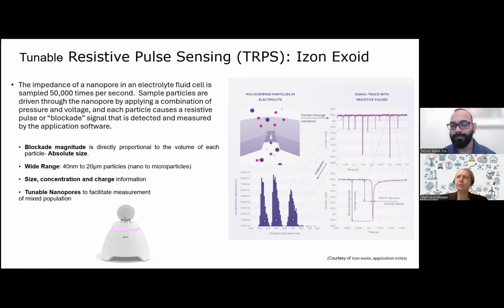Because you mentioned hydrodynamic, right? For viewers, also just remind it's about DLS. And I think, Rahul, you mentioned that the size will be different in DLS and by other techniques. I remember it can be distinctly, slightly over in size. I remember when you compare with electron microscopy sizing for the same material, the difference was about 10 nanometers.